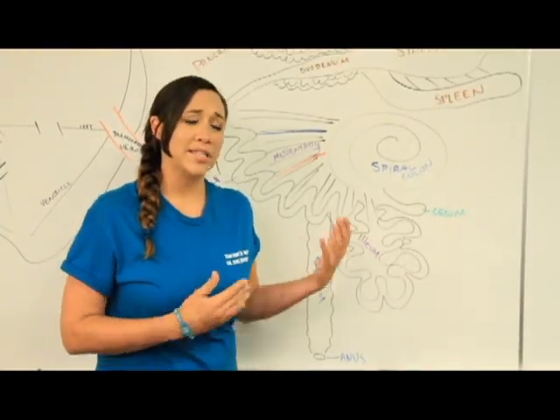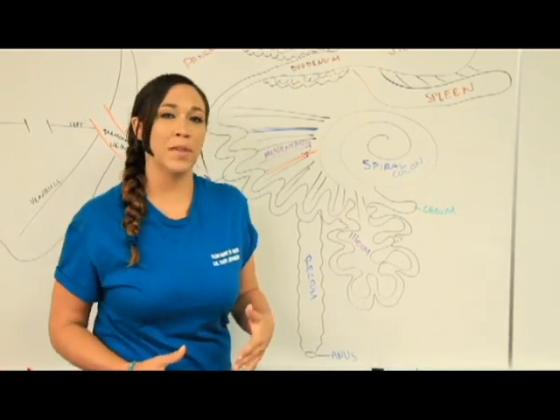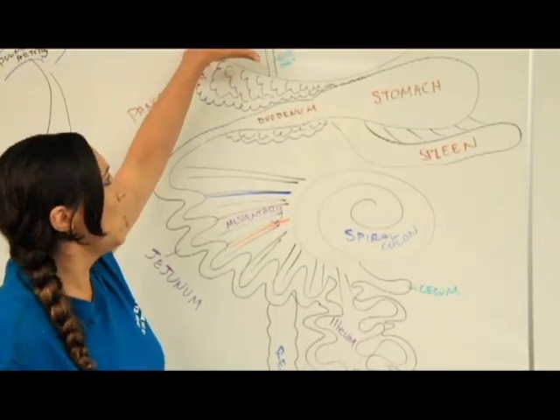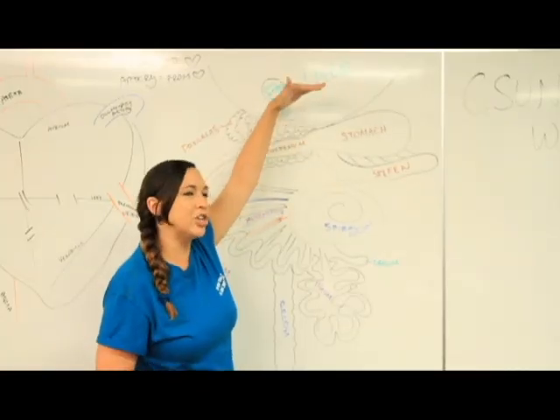Okay, so now I want to go through this diagram with you guys so you really understand the positioning of all these organs and the difference between them, so that when we actually get into the pig, it'll be easier to identify each one of them. Okay, so we're going to start at the top where the liver is. So imagine that we've lifted up our liver. So we're looking kind of underneath our liver.